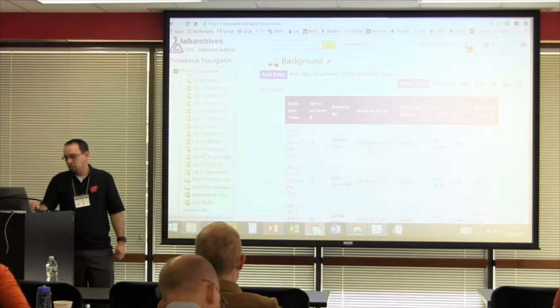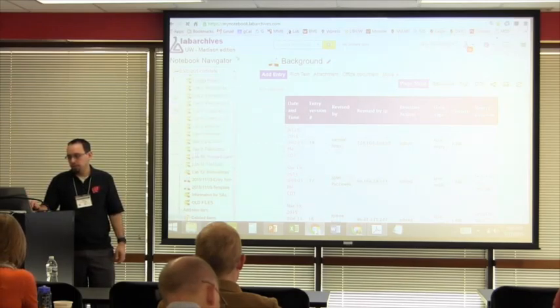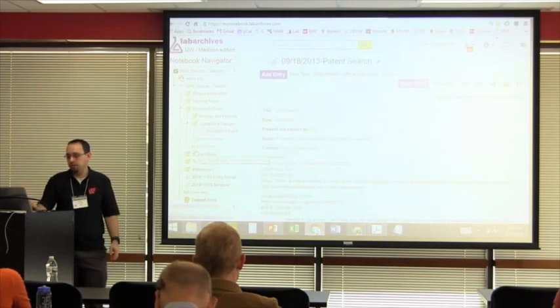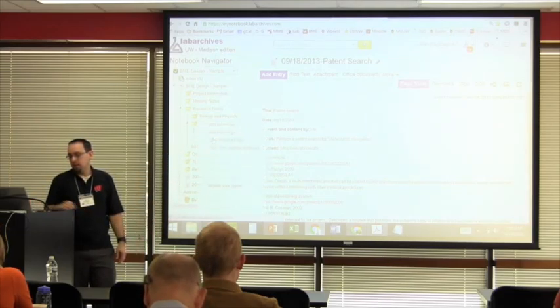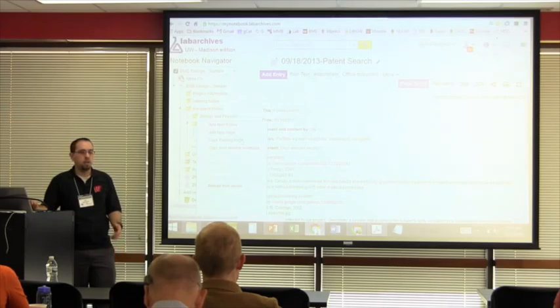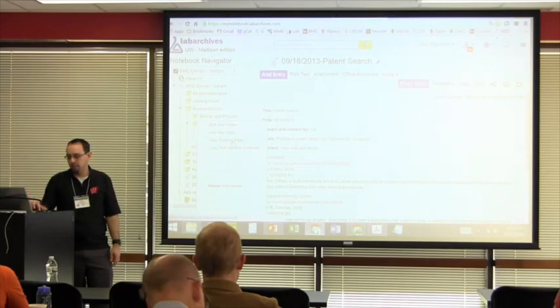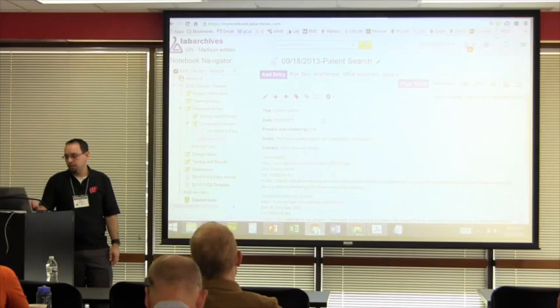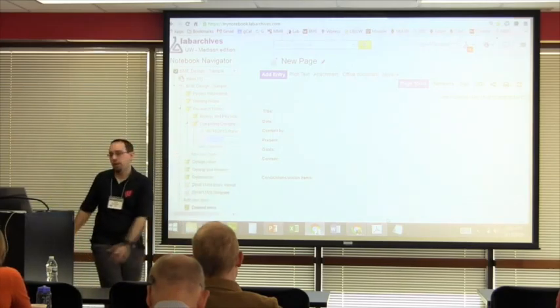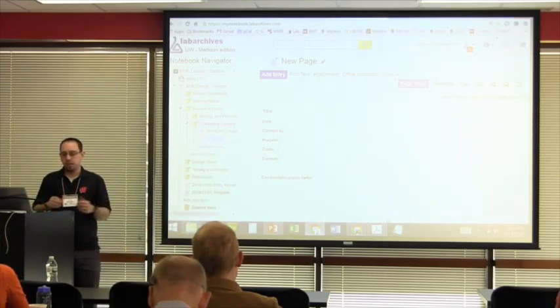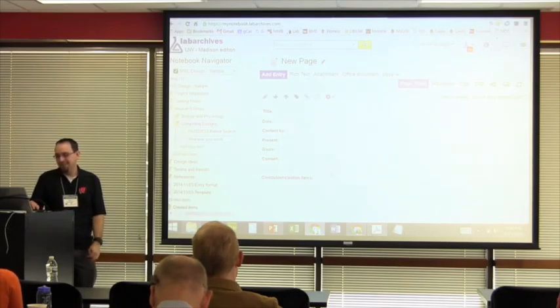So one of the really neat things — you can go over here at the top. You can actually pick whatever notebook you want to pick, so you can pick for different classes you might have. To create entries, you can just click on Add New Item. And you can do different things: a new folder, a page. You can copy an entire page you have, or copy from another notebook. So what we do for our template is we have them copy an existing page. They just pick the template and hit create. What they now have is a way to automatically name that page — we give them the format to use the date in their page names, but you can call it whatever you want.